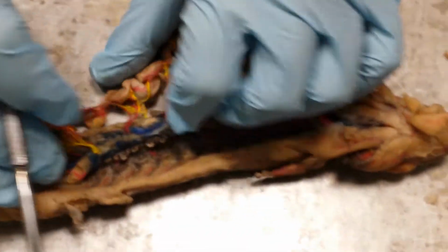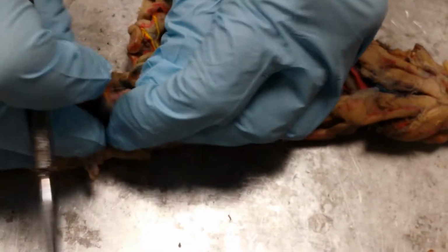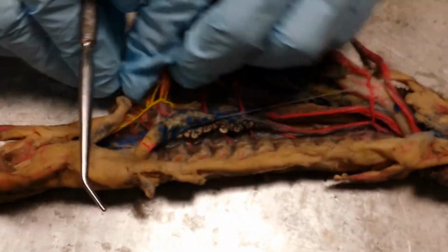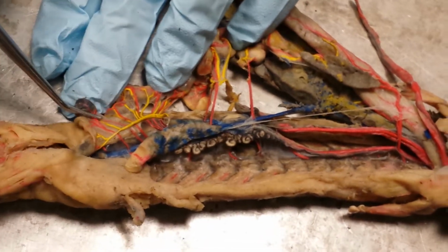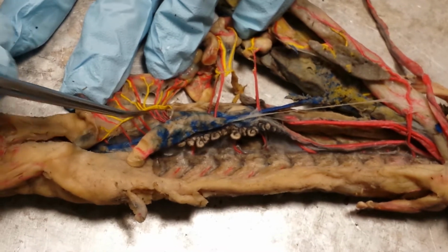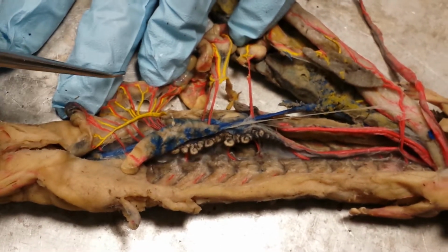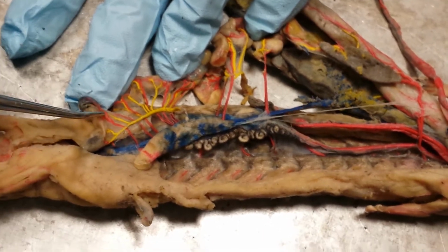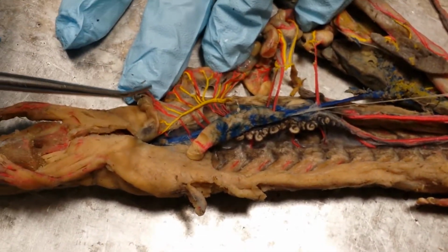If you follow the dorsal aorta down a little bit more, you come to your small intestine. If you stretch the small intestine out and you stretch open the mesentery proper, you can see that in the mesentery proper are several pink and yellow vessels. The pink vessels are the mesenteric arteries, and the yellow vessels are the mesenteric veins.